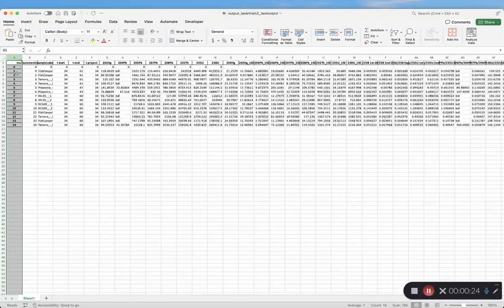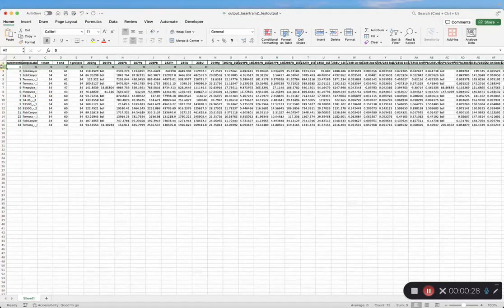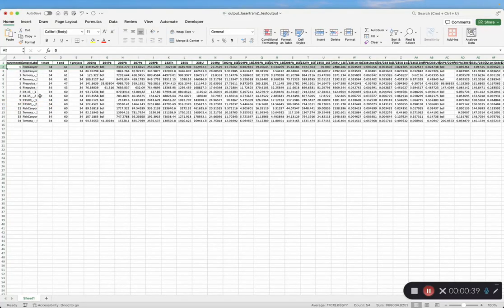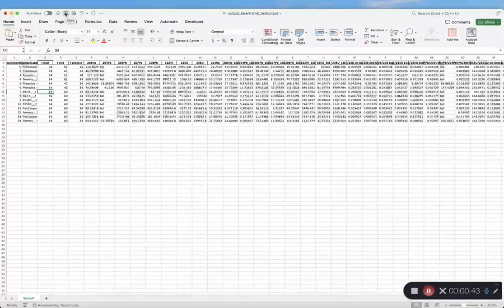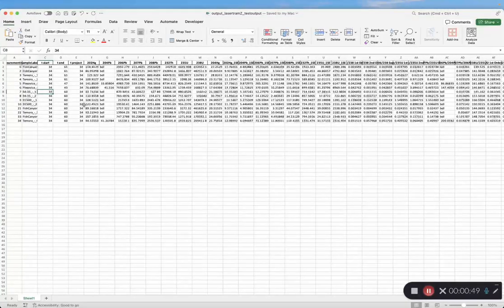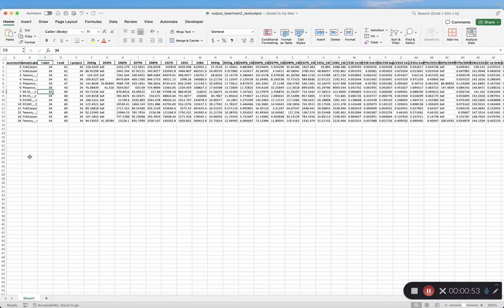We need to delete this first column, and we need to delete the first row. Sorry about this minor inconvenience. There are some things that I need to work out in this program still, and that's because I've been focused on LaserTRAMZ for multi-collection, and that program actually runs way better than this one, so you have that to look forward to once that's available publicly.